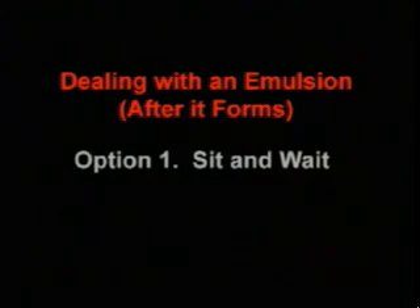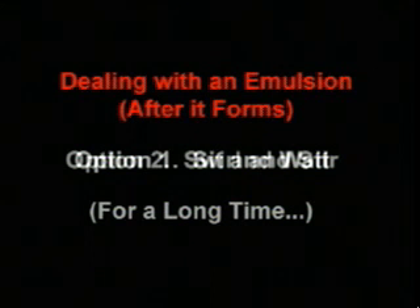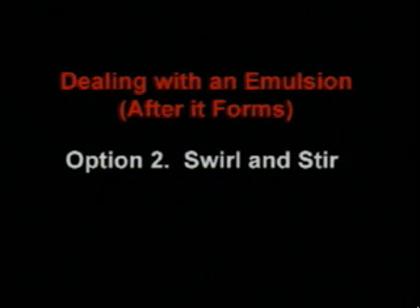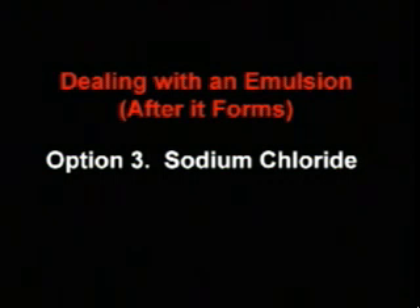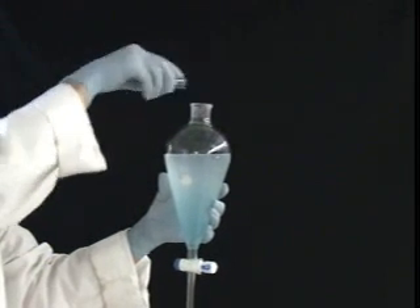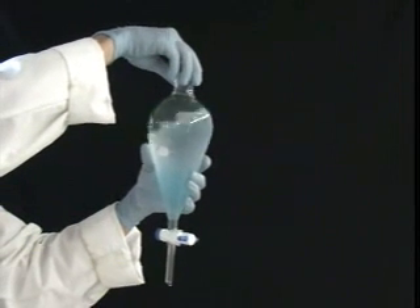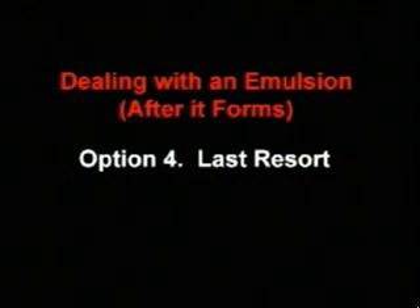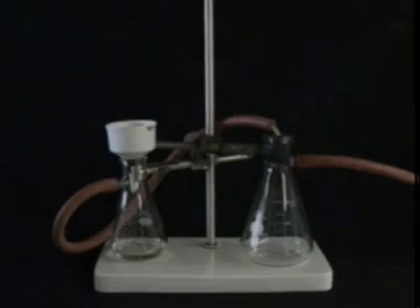Don't worry — if you unwittingly generated a monster emulsion, you still have a few options. First, you can just sit and wait; it might clear itself up, even if it takes a few hours. If you don't have all day, try swirling the mixture gently and stirring the emulsion with a glass rod. If this doesn't work, add several milliliters of saturated sodium chloride solution to the funnel and swirl to mix. The sodium chloride increases the ionic strength of the aqueous layer and decreases the solubility of the organic solvent in the water. As a last resort, you may need to use vacuum filtration to filter your entire mixture through a pad of Celite.